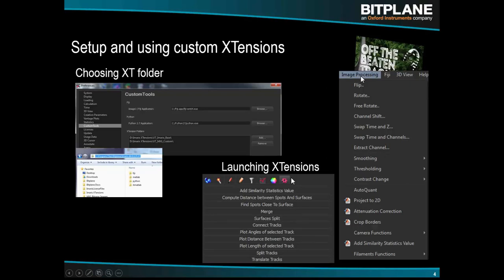Once your extensions are loaded, they'll appear in two places. First, within the tab in Imaris — there's a little gear icon within the Spots or Surface tab in the Surpass scene. Second, all extensions will show up in the Image Processing tab in a dropdown at the bottom, provided your tabs are active and MATLAB or the MATLAB compiler runtime is installed. You can run them from either location.